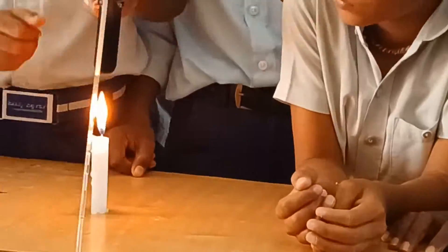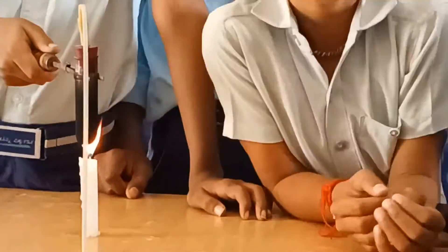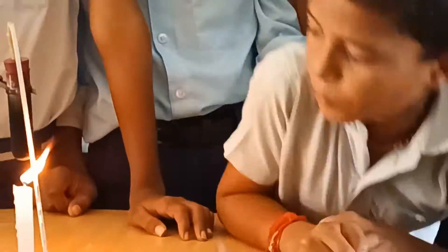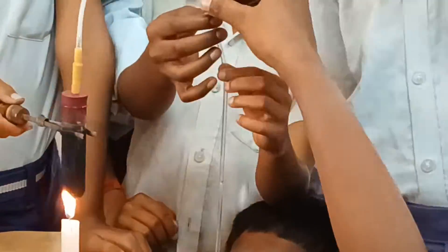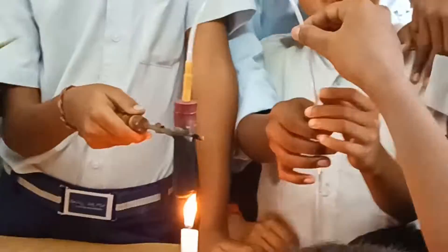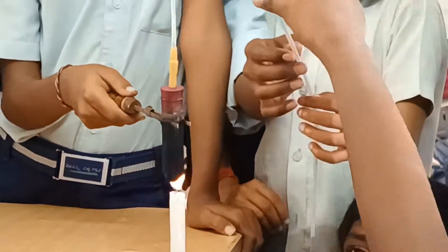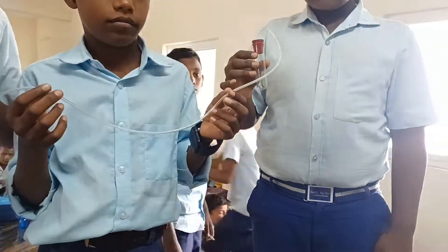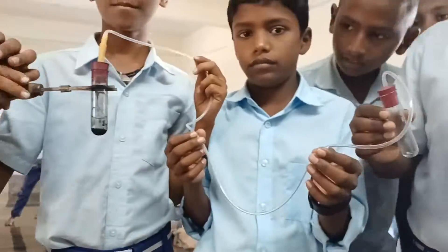Initially, they attached the saline pipe directly to both the test tubes. Then they understood that only a small pipe is needed to get the distilled water. So they prepared the setup again and finally got the results.